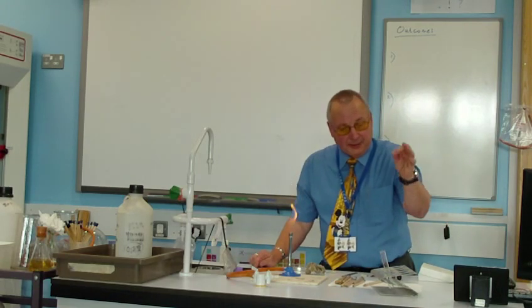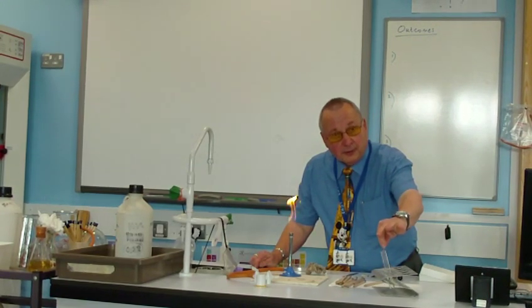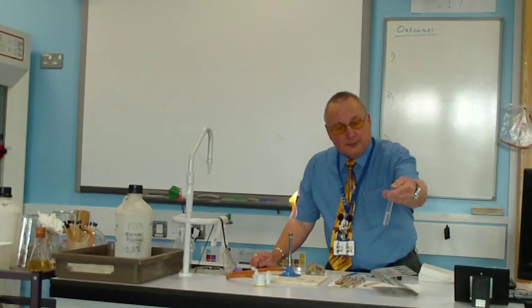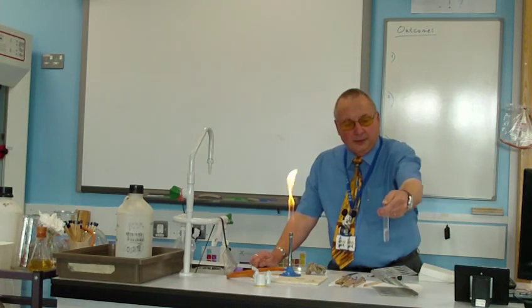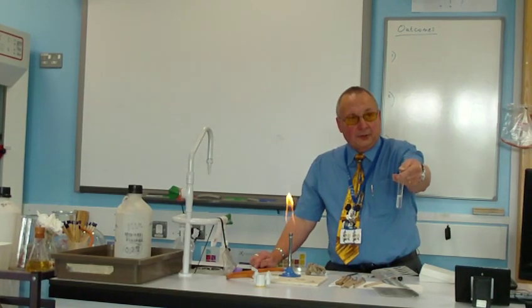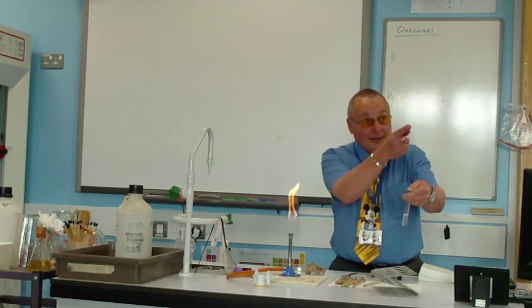So, watch how you're going to do it. We work in pairs for this. I'm going to drop the piece of magnesium in there. Can you see it? It's reacting, isn't it? And I'm going to keep my thumb over until... What's it producing in there?